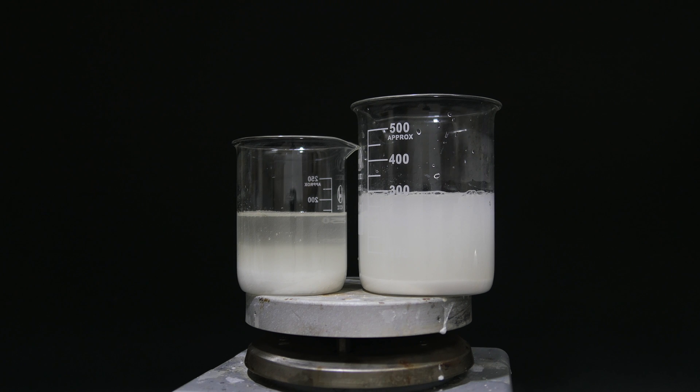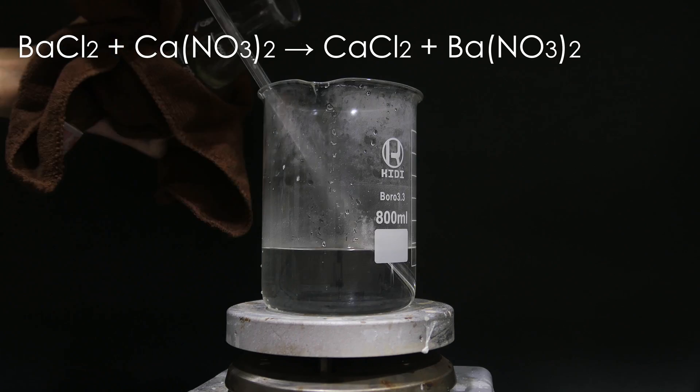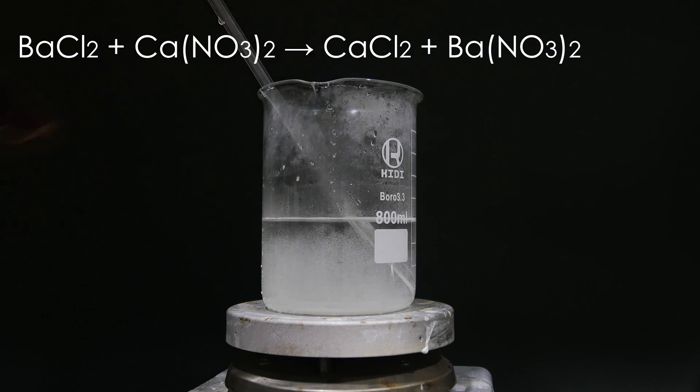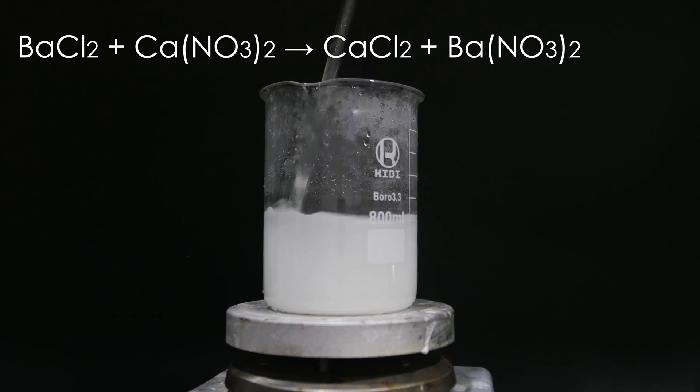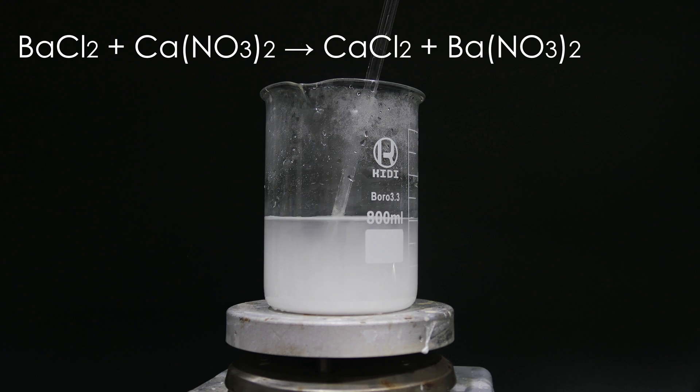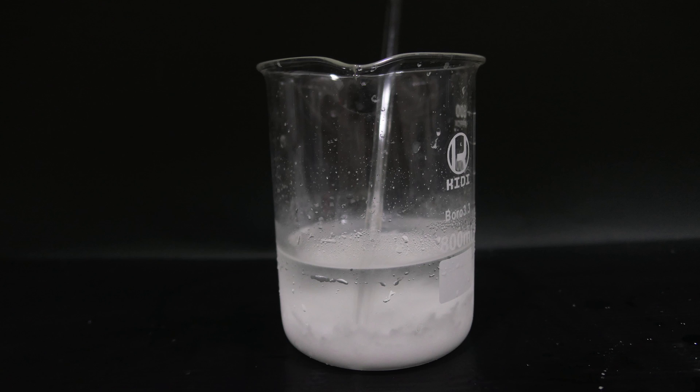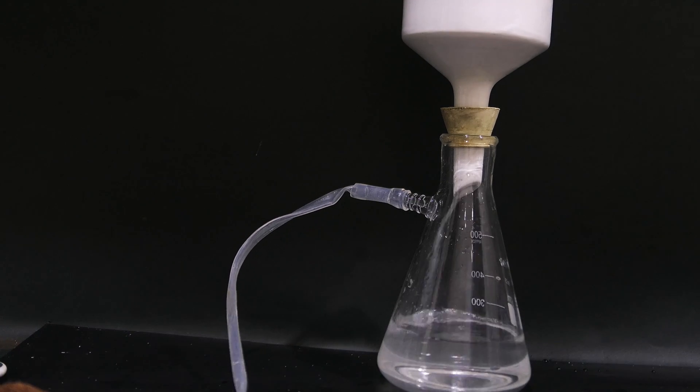Here, I dissolve one mole of calcium nitrate and one mole of barium chloride. Then after hot filtration, I mix the two solutions and allow it to cool. Then barium nitrate is filtered out. Yield is 45%, probably most of the product is still in solution.